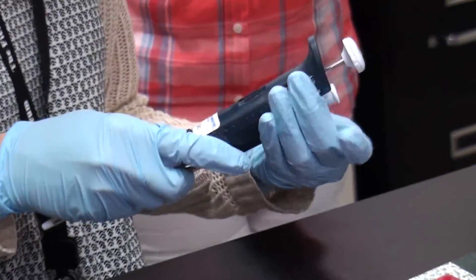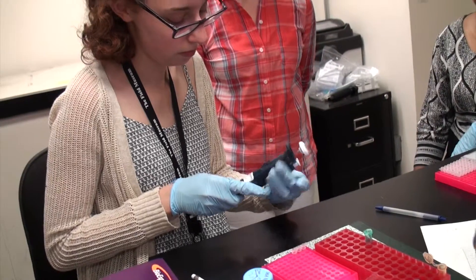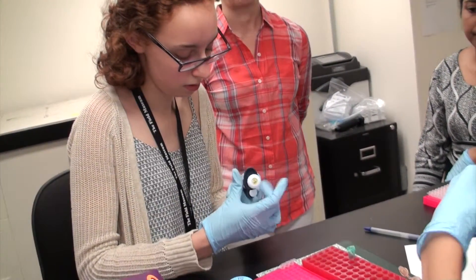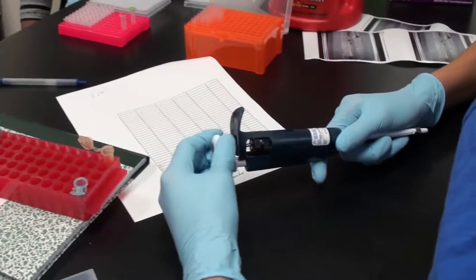Today I would like to talk a little bit about the process of cycle sequencing and Sanger sequencing, which is something we use to get our end results so we can look at different parts of genomes that we have sequenced.